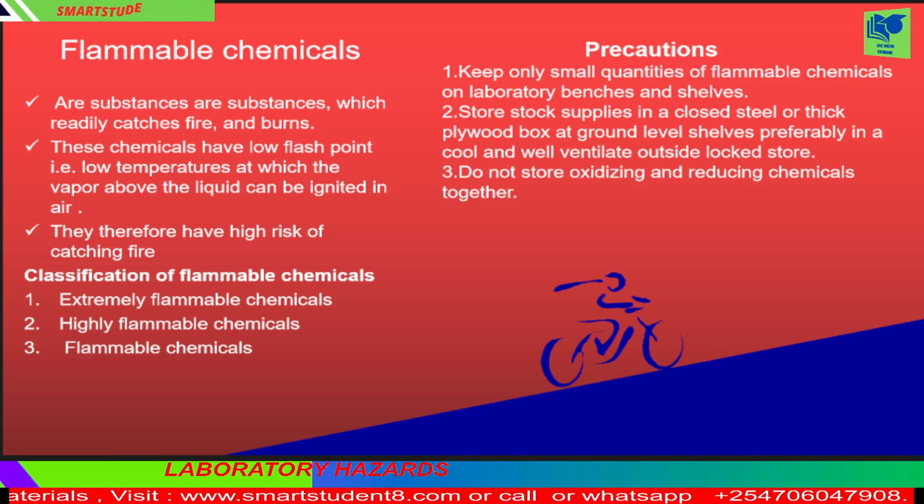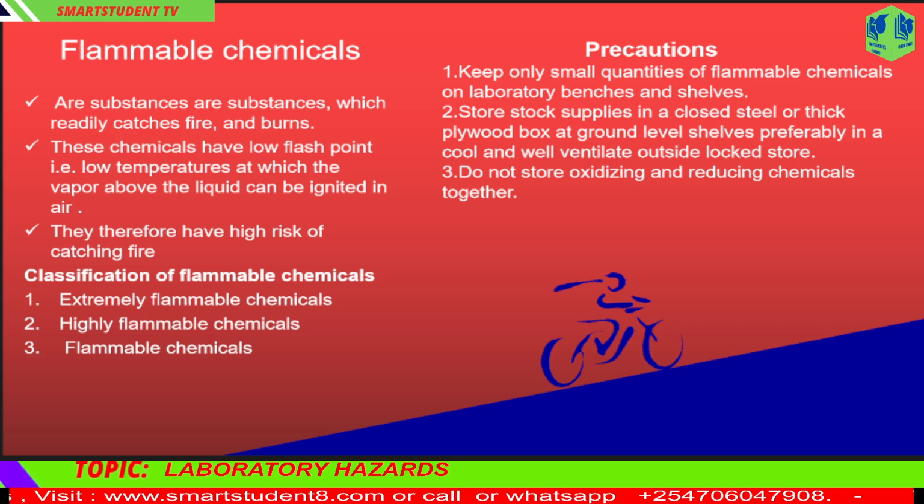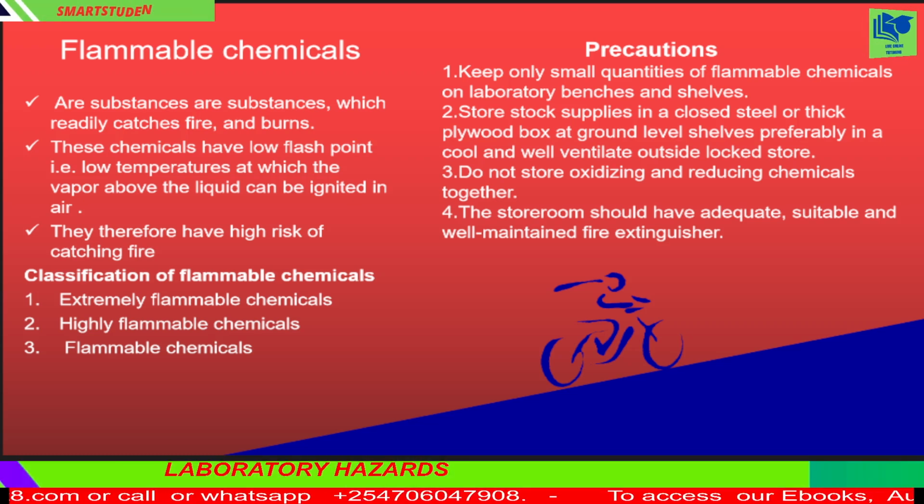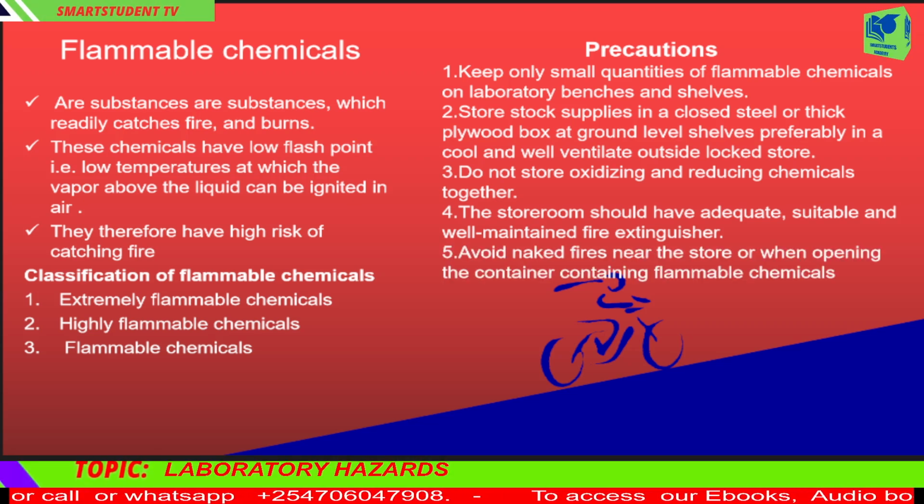3. Do not store oxidizing and reducing chemicals together. 4. The storeroom should have adequate, suitable, and well-maintained fire extinguishers. The lab should also be well ventilated. 5. Avoid naked fires near the store or when opening the container containing flammable chemicals.